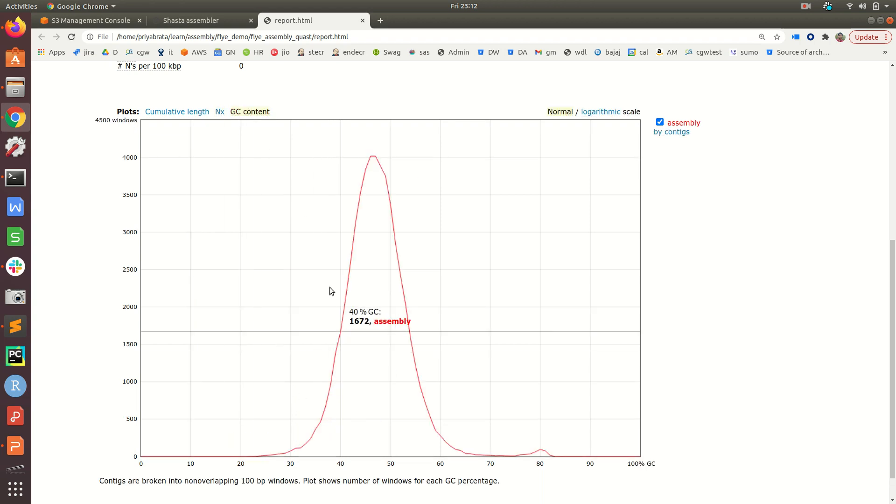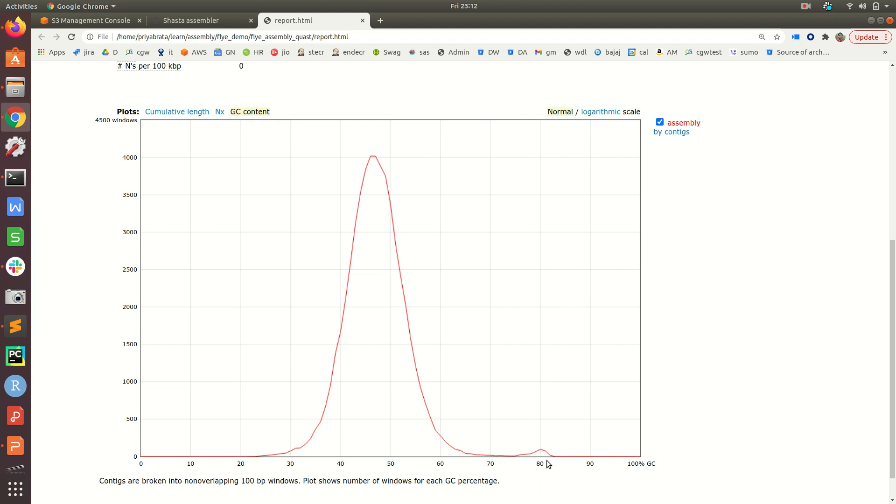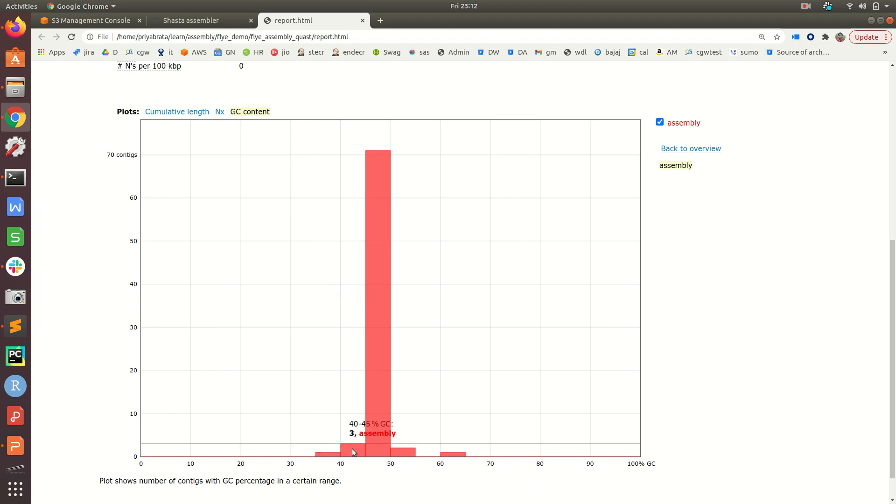Lastly, we can check the GC content. It clearly shows a normal distribution with a slight peak, meaning some contigs have higher GC content around 80 percent. You can also check by contigs. You can see one contig has GC content between 35-40%, three contigs between 40-45%, and the majority, 71 contigs, are between 45-50%.